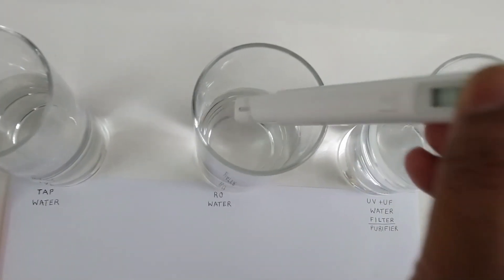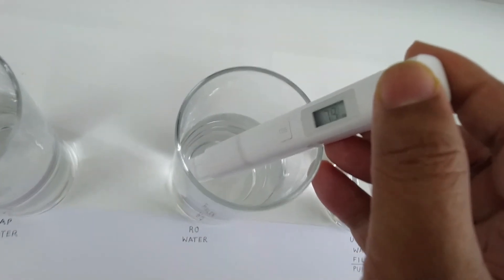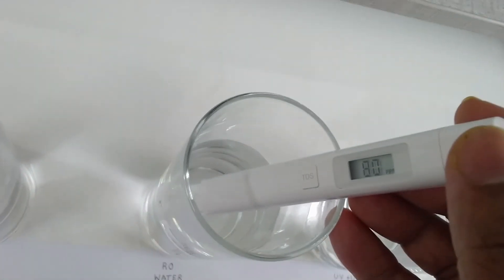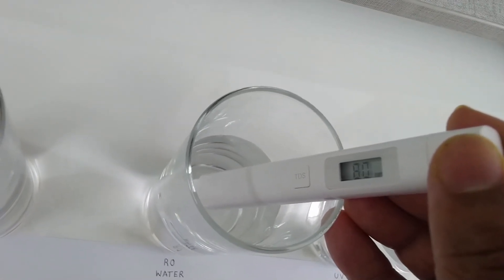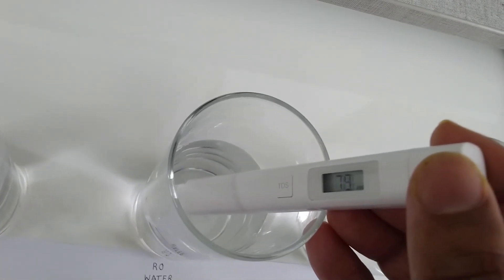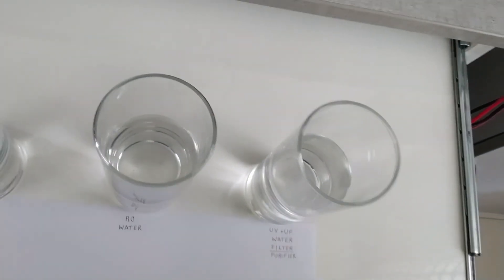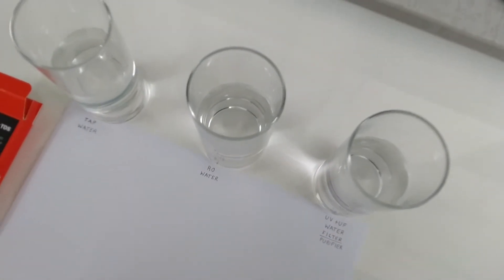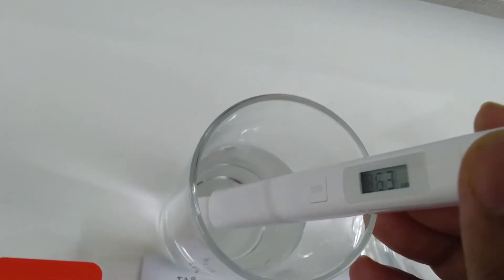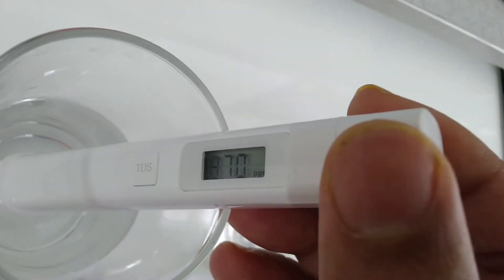Now let's test RO — it's showing 80. And for the tap water, it's showing 870.